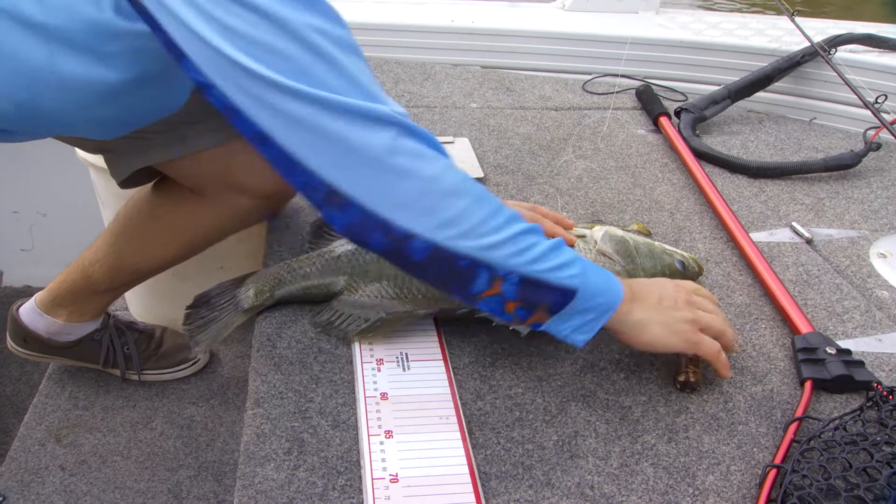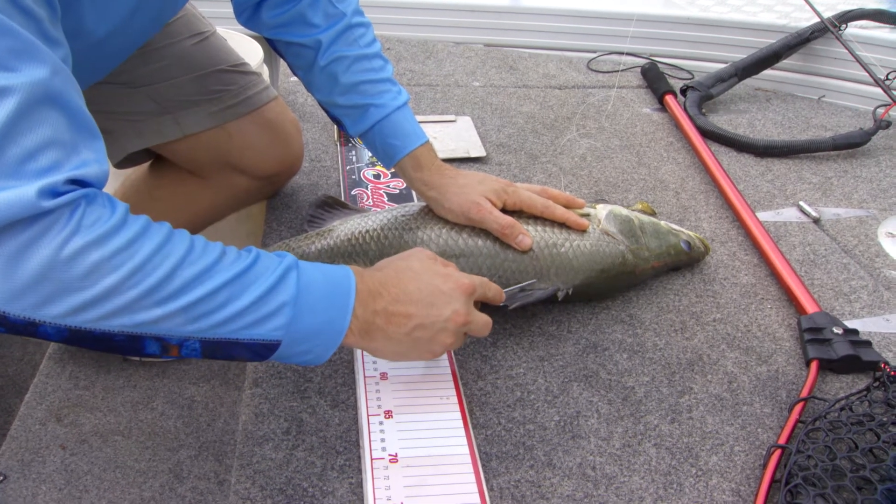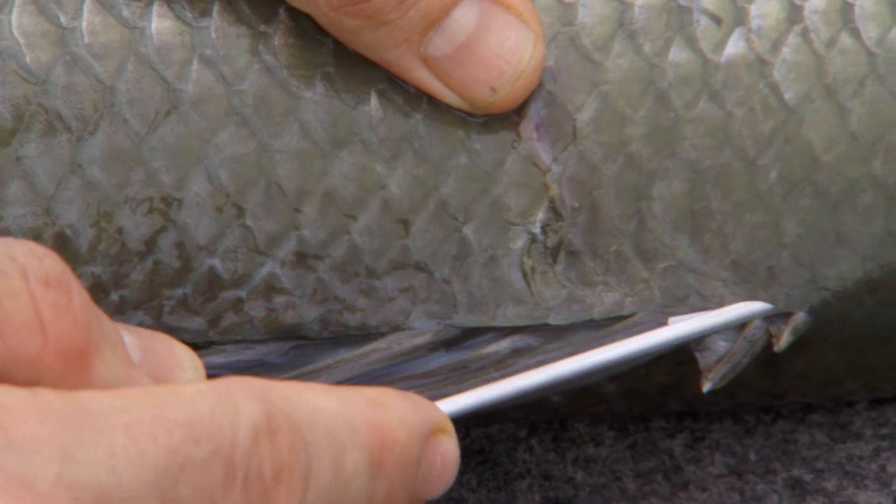Once you have the tag ready, hold your fish securely and insert the tagging applicator at a 45 degree angle. You need to locate and remove a scale that is approximately two and a half centimetres below the main fin spine.